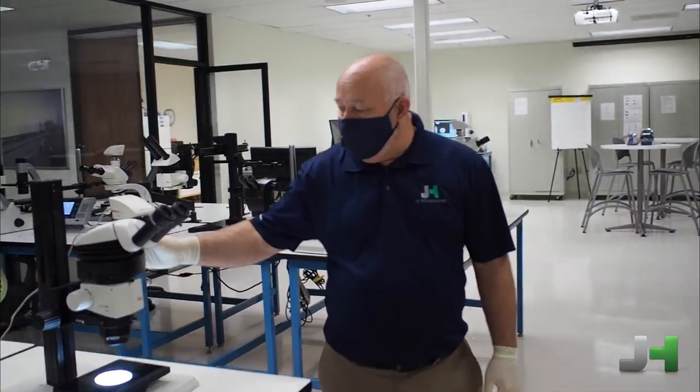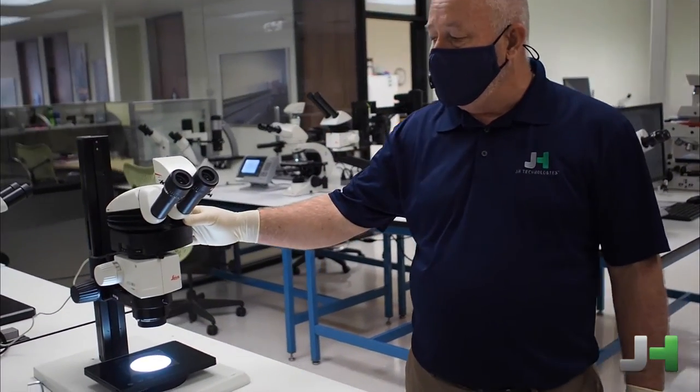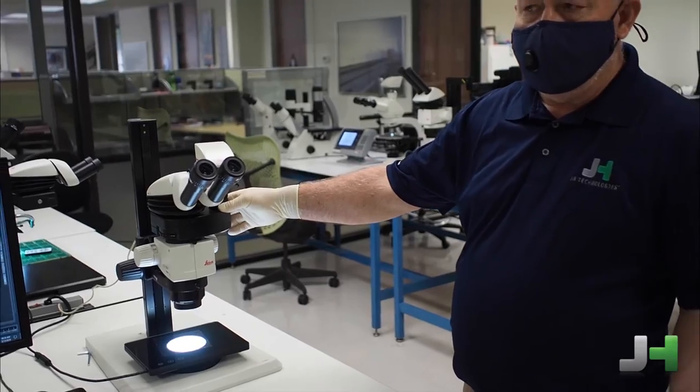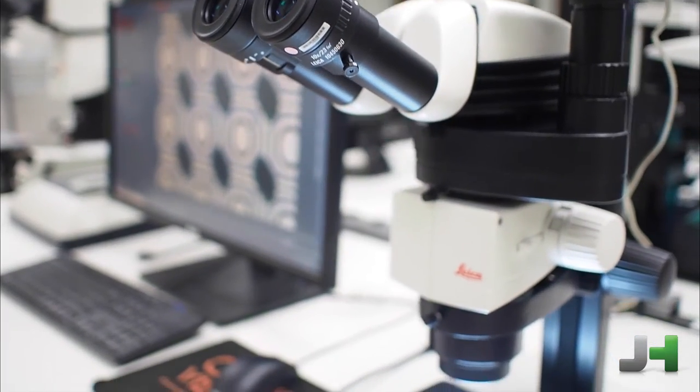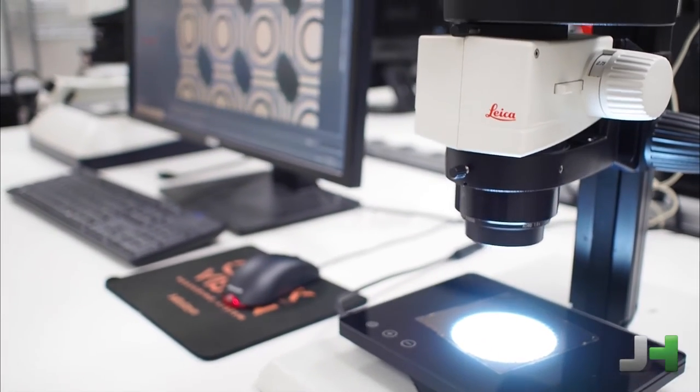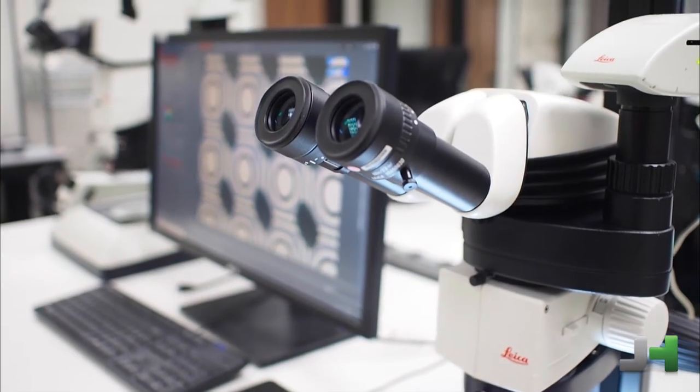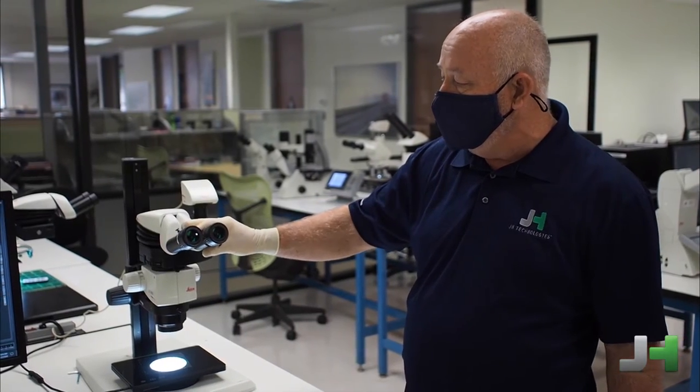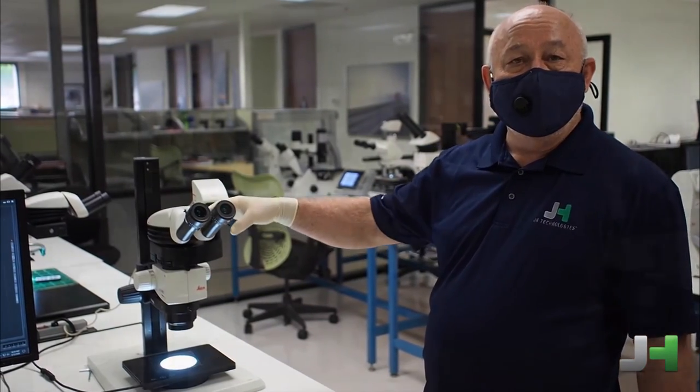This is a Leica M80. The M80 is primarily used as a routine microscope. And by routine, basically it means it's being used typically in a manufacturing environment for inspection or work underneath. And it is an ergonomic microscope. So we do have ergonomic microscopes as well as standardized microscopes.